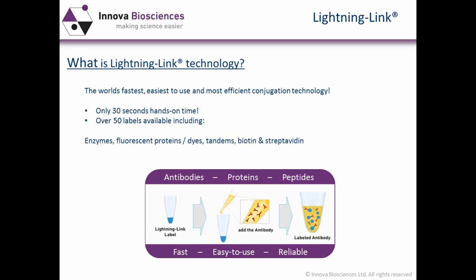You take your antibody, you add a small amount of modifier reagent to that, and immediately then use that material to reconstitute a freeze-dried pellet of fluorescent dye. You can then leave that to incubate for either 20 minutes or 3 hours, depending on the format of the kit that you're using.